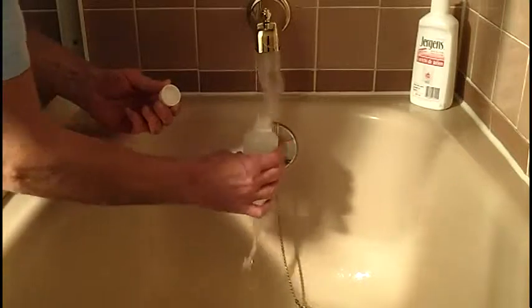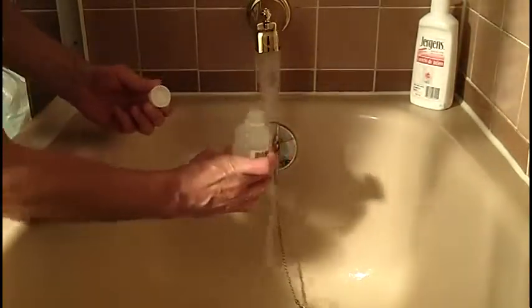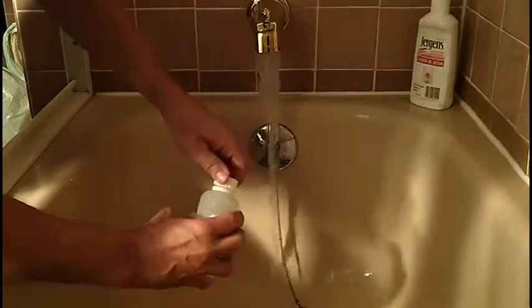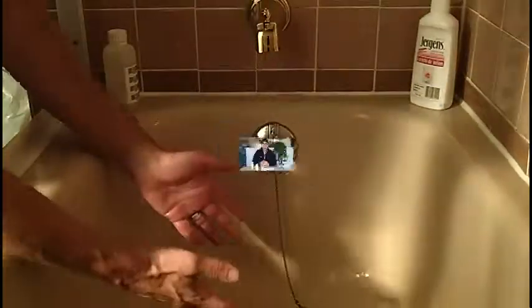The bottle has a preservative in it. Put the bottle underneath and fill it up to the line. We're still holding onto the cap. Screw the cap back onto the top of the bottle, set it aside, shut off the water, and we're done.